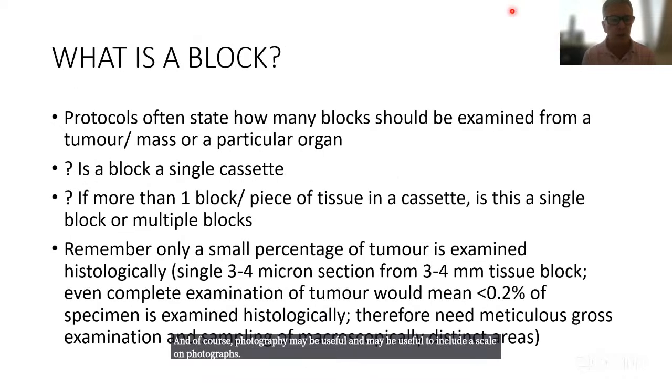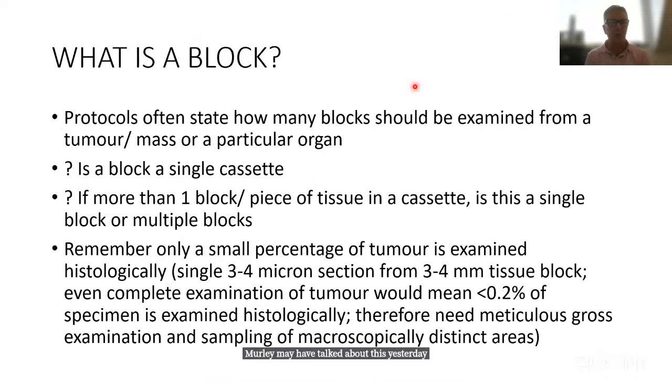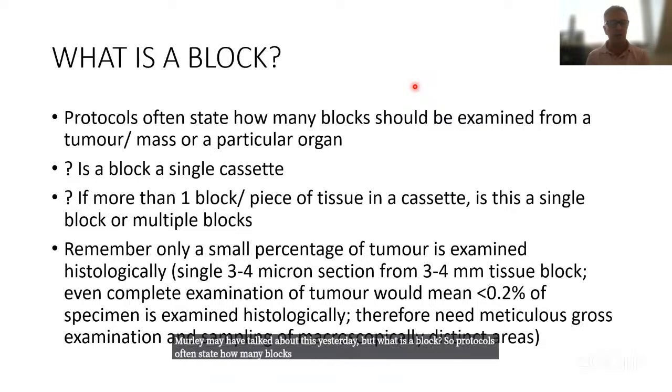Murray may have talked about this yesterday, but what is a block? Protocols often state how many blocks should be examined from a tumor or a mass or a particular organ, but it's not clear, is a block a single cassette, or if there's more than one piece of tissue in a cassette, is this a single block or multiple blocks?